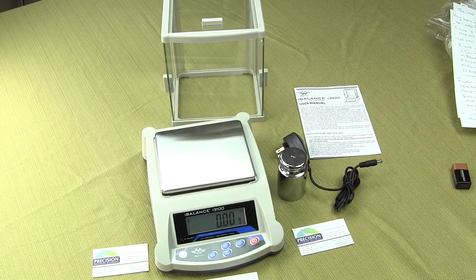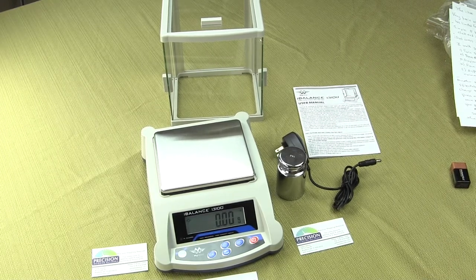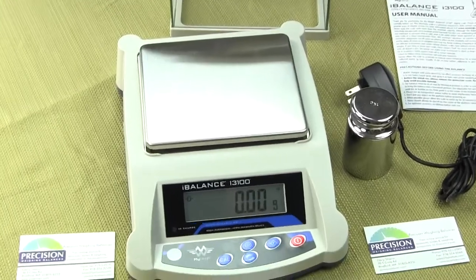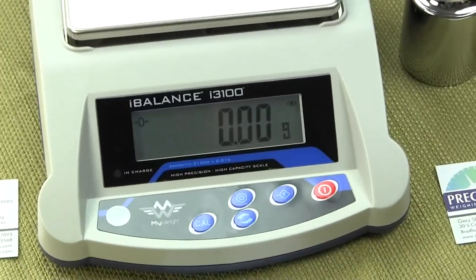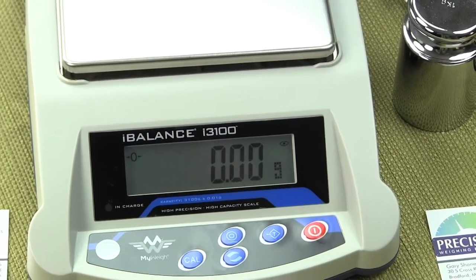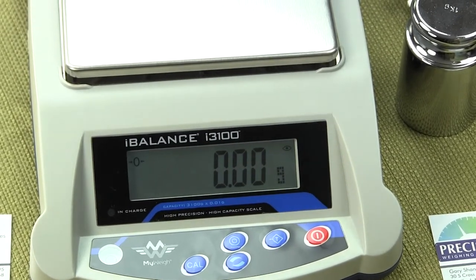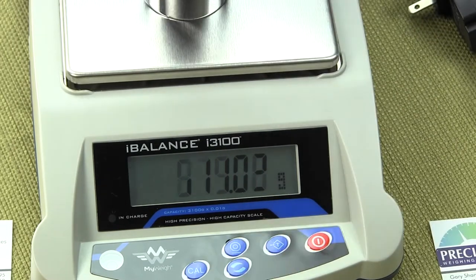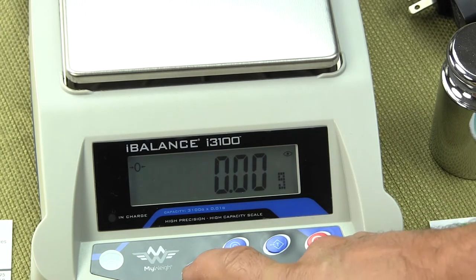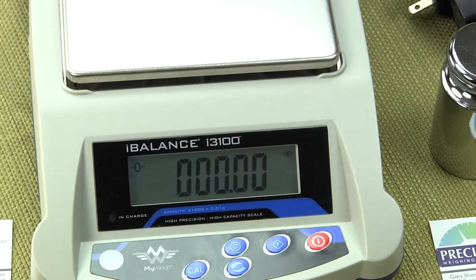I want to walk you through how to perform a calibration on this balance — I'll zoom in on the display so we can get a better view. We're going to perform a calibration and you'll see how easy it actually is. The balance comes with a one kilogram stainless steel mass. To perform calibration, one simply presses and holds the CAL key. The balance will show CAL and then flash the calibration weight required.